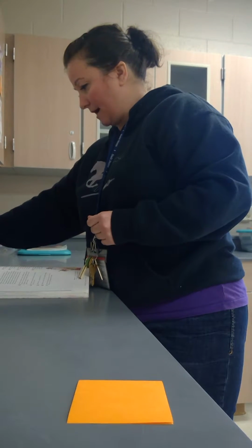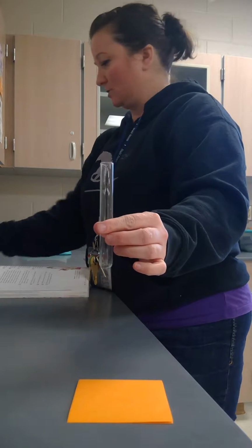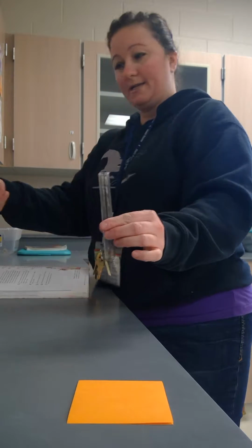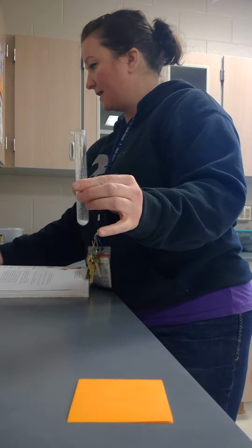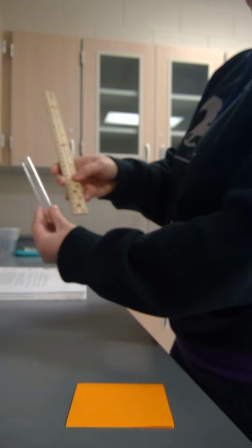And so to complete this lab correctly, I would take my sodium chloride and a test tube. So here's my test tube, here's my sodium chloride. And in it, I'm going to put in 1 scoop into the tube.